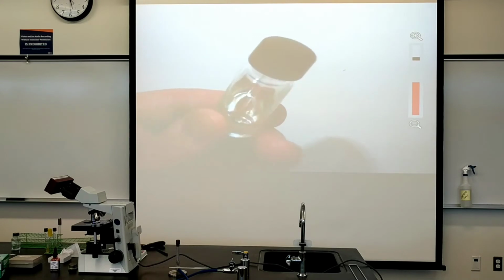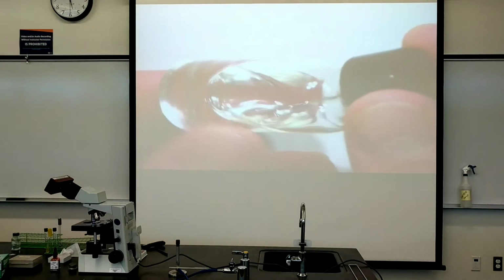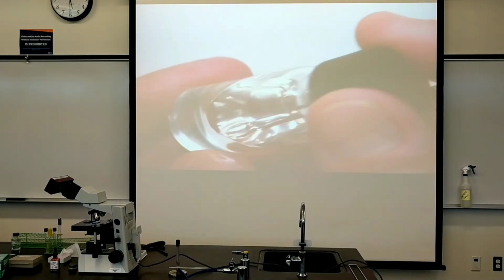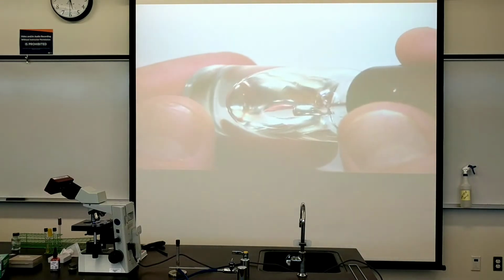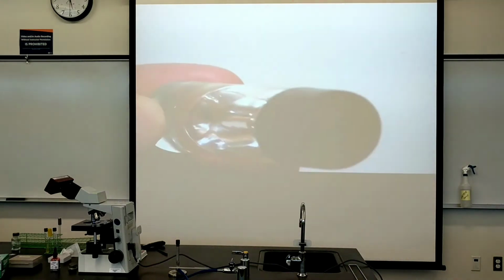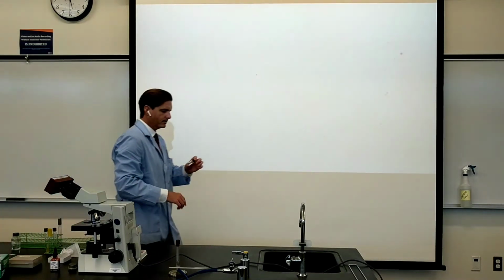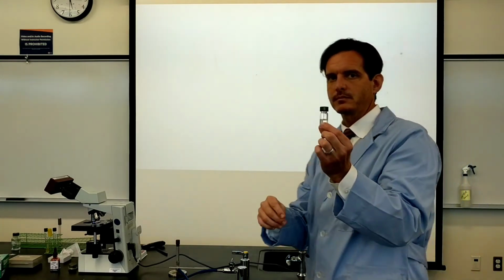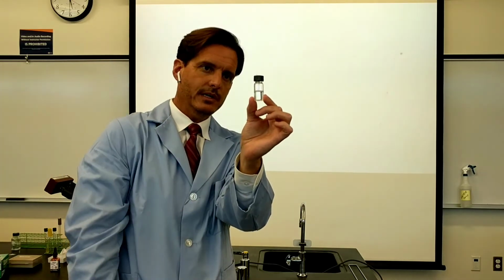So we'll zoom way in on this, and you can see, let's see, that's not showing it very well. Let's try something else. If I hold this up in front of the camera, you can see the light that comes through it.